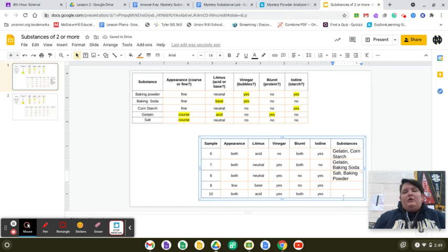All right, we're going to do one more just because this is going to help you later on as well. For question 3, I think it is on the assignment. So right here, again, we start exactly the same. Start with protein. All right, this one says no, so we know it does not have gelatin. All right, so then we're going to go to litmus. Well, it says base. Well, there's only one base, and that is right here, and that is baking soda. So we know it's got to be baking soda.